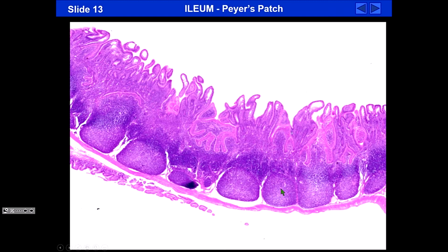So because you've got more cytoplasm relative to the nucleus, it's going to be a lighter staining area, right? B cells, mostly nucleus or a thin rim of cytoplasm. Plasma cells, a lot more cytoplasm, so it's going to stain lighter in the germinal center where we have many more plasma cells. Other questions? Yes.